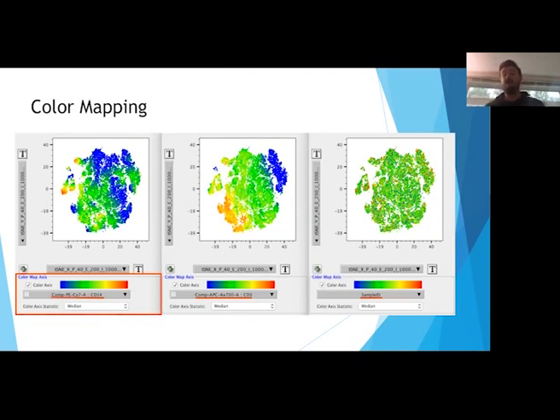This is the parameter that separates out our different samples. And what we should see there, if we've done good t-SNE mapping and we're not too biased by the individual samples, is a randomization of these colors. I think here, this illustrates that pretty well. We don't see a clump of red events anywhere that would indicate that our final population is biasing the whole mapping, or any other color for that matter, because that can happen.